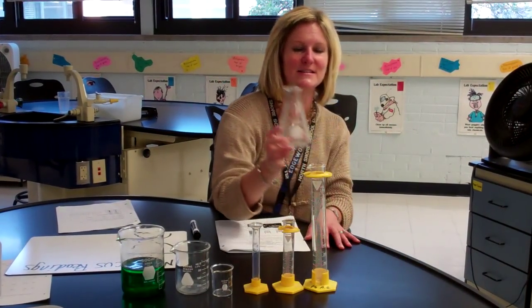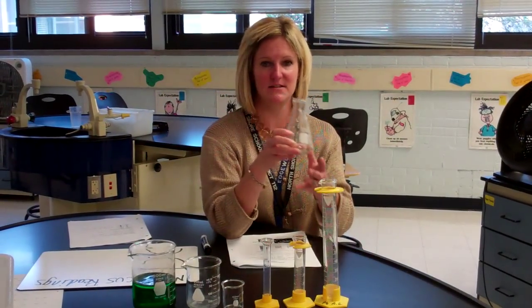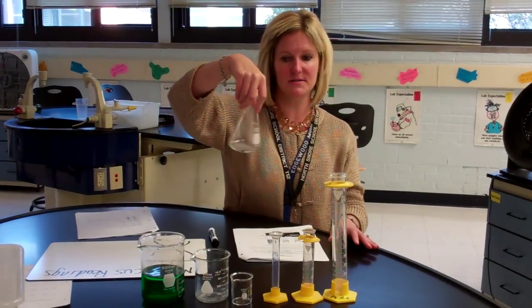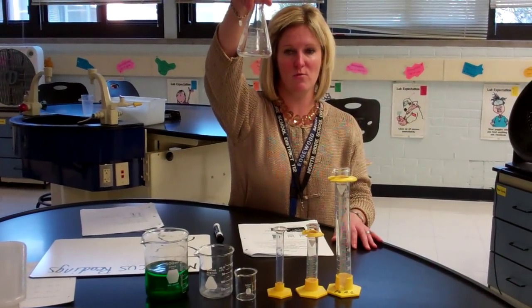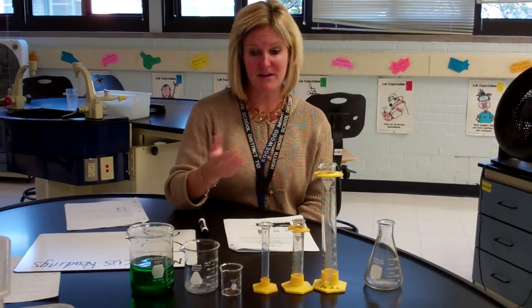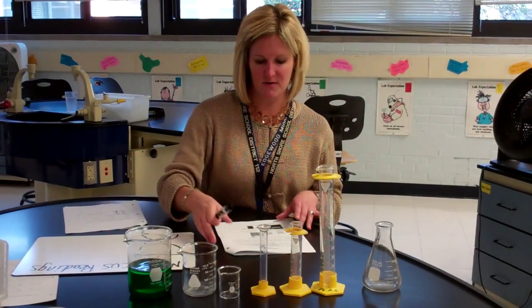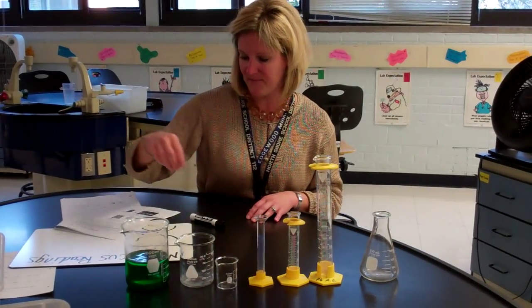And then last but not least, our Erlenmeyer flask. Our Erlenmeyer flask is usually utilized to mix some chemicals together, so we will utilize that as well this year. So a couple things about how we measure with the glassware. The first thing we do is take a look at how we appropriately use the glassware.